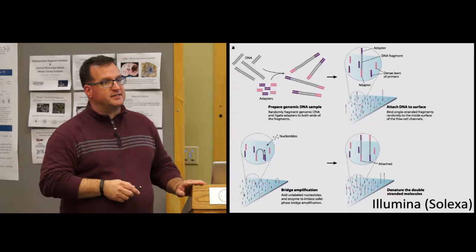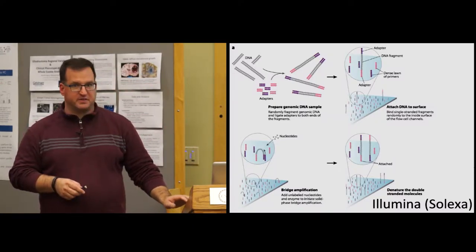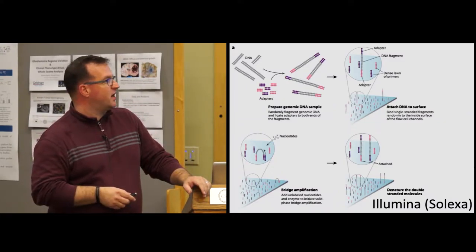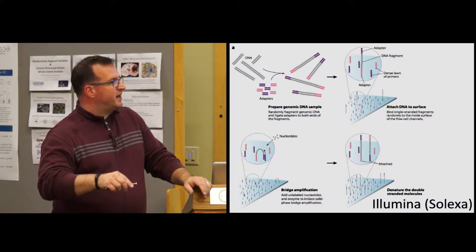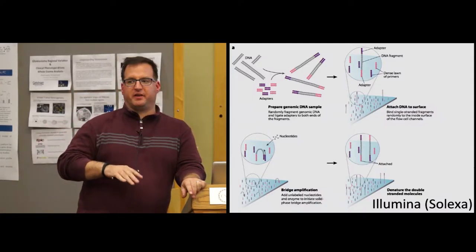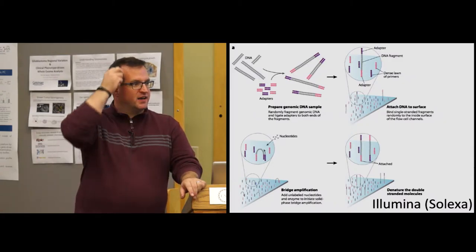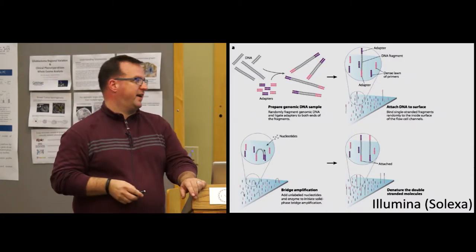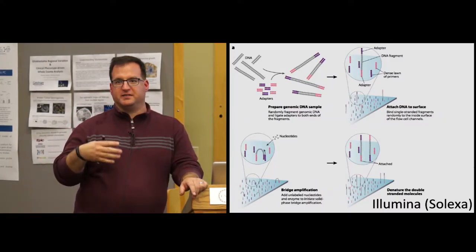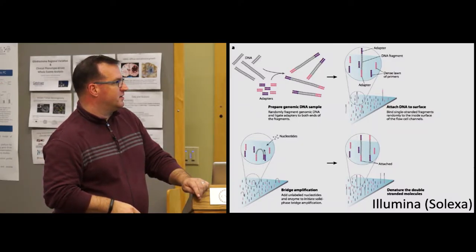Right. So next thing to talk about is Illumina. Illumina is not just the elephant in the room, but the monster in the building. Incredibly successful technology. I like to remind people that Illumina was actually a genomics biotechnology company before sequencing. They did microarrays. They did SNP chips using a very ingenious little bead array technology. But now most people have name recognition for Illumina because of sequencing, and that sequencing came from a British company called Solexa.